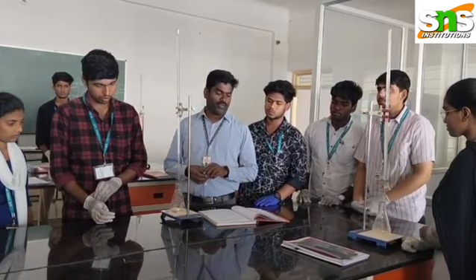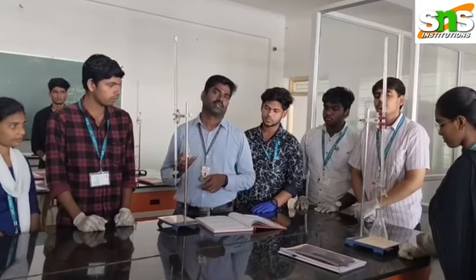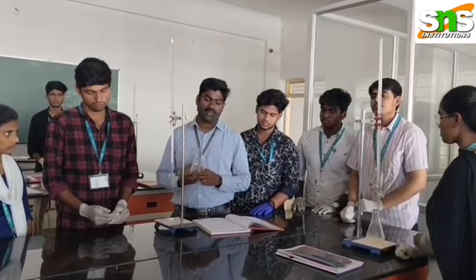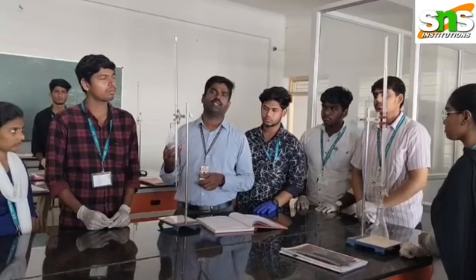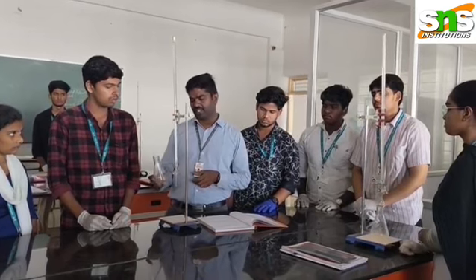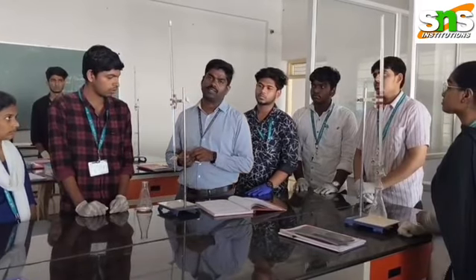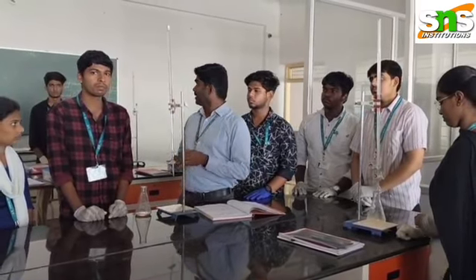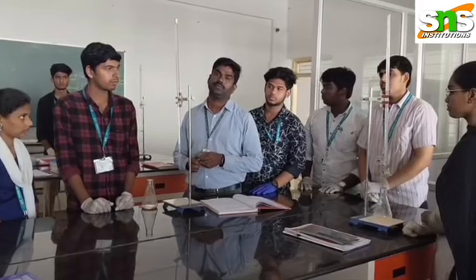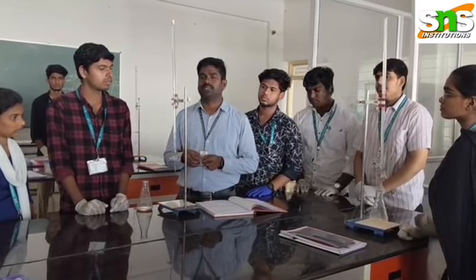This 0.1 N sodium carbonate solution was taken, 10 ml, in this conical flask. Then we added methyl orange as the indicator, 2 to 3 drops. So now this is ready for the titration. Before that, we filled this burette with 0.1 N sulfuric acid. You can see the titrant here, and the titrate was taken in this conical flask. The titrant today is 0.1 N sulfuric acid.